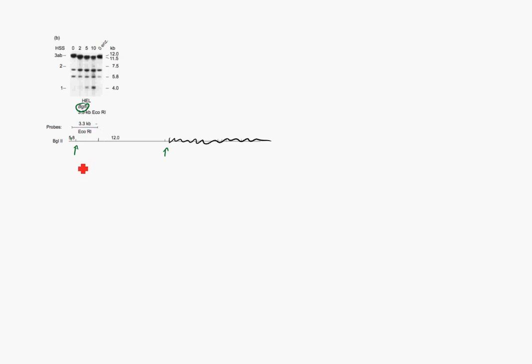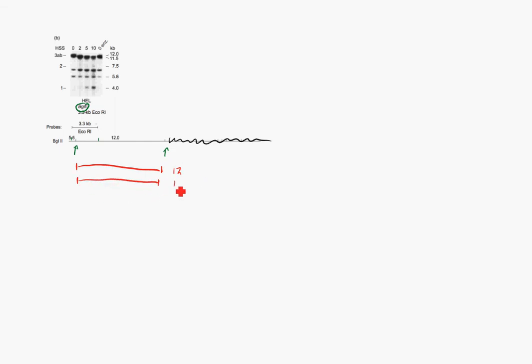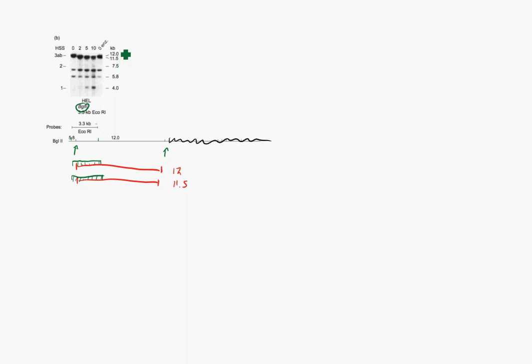Now again, we have our probe, which now is this 3.3 KB Eco-R1 probe that binds right about here, and it does overhang a little bit there, but that's okay. There's enough of it that it's still going to bind. And so this shows up in these two lanes here. So they labeled these 3A and B, and these are the same, made from the same hypersensitive sites as in the previous assay, that they also labeled 3A and B.